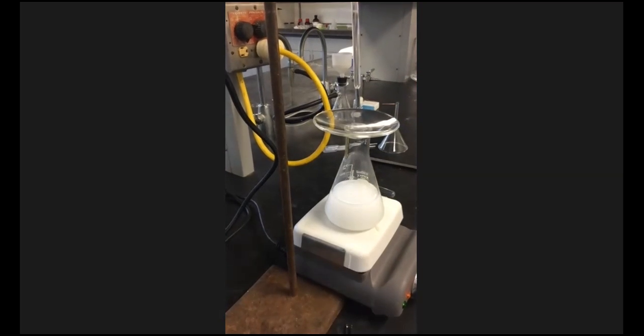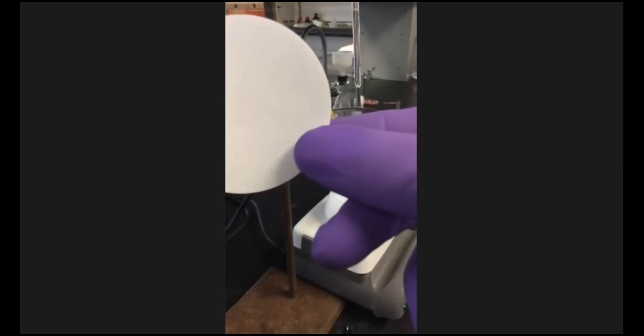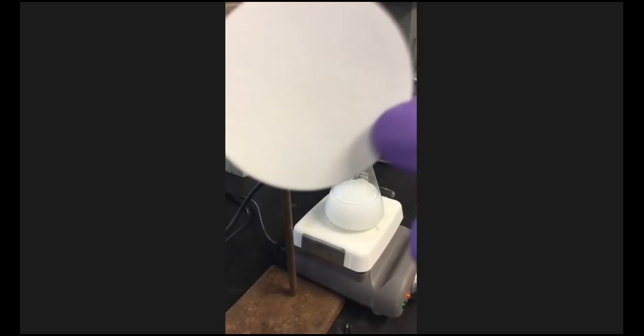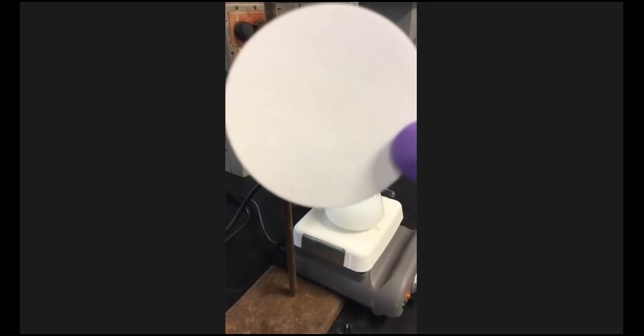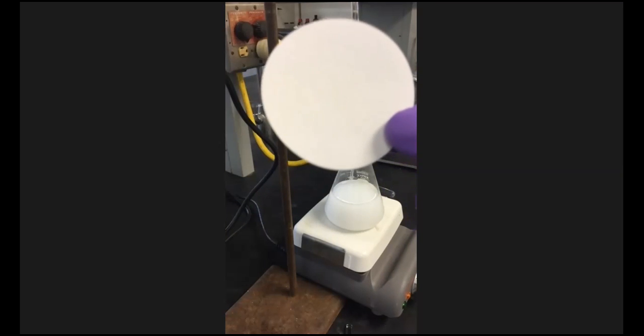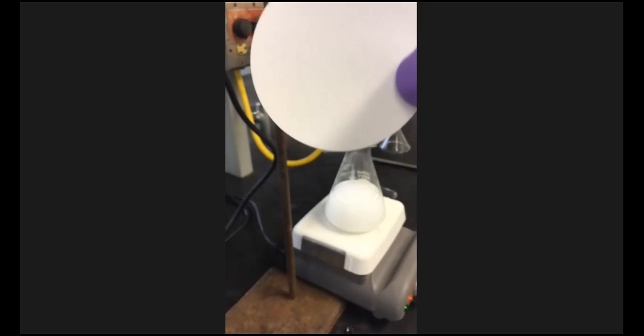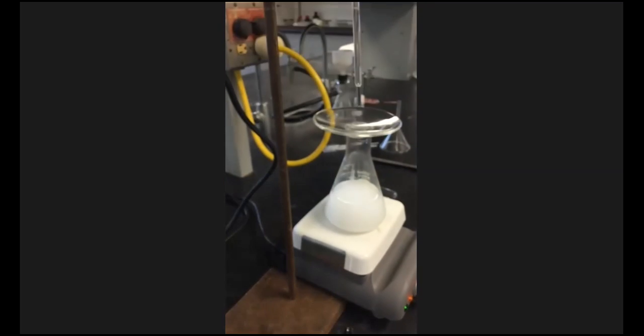So let me go ahead and weigh the filter paper. All right, so your filter paper is just this little white disc. I know it looks like it's pretty tightly woven, but it's actually very porous, right? But you don't want it to be too porous because then you don't want small particles to be able to slip through. So your filter paper, once you weigh it, we're gonna set up a vacuum filtration apparatus, which is over here.